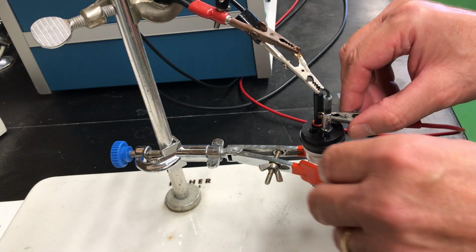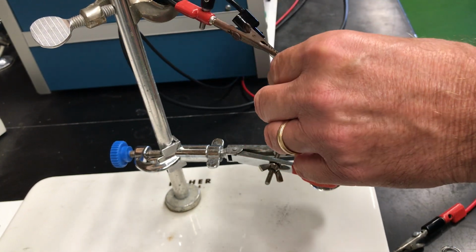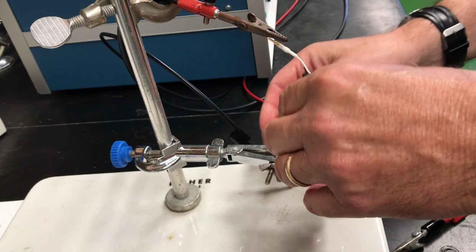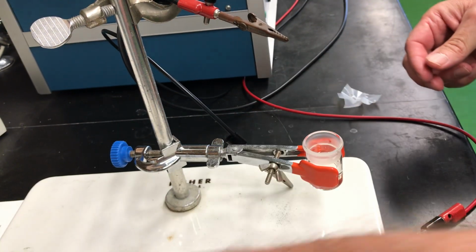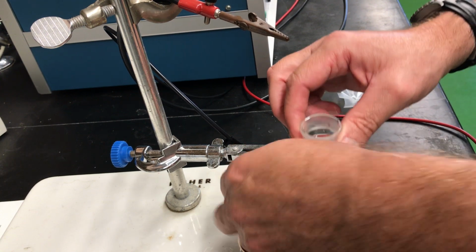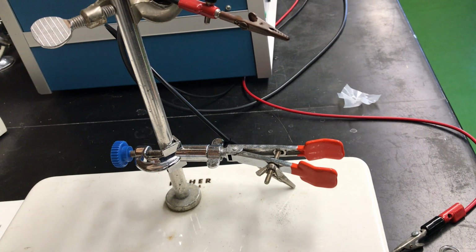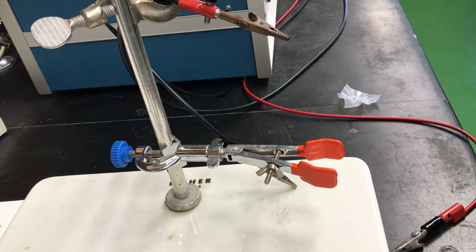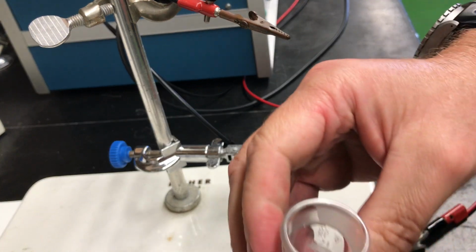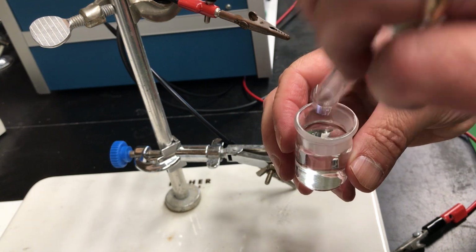All right, so I'm going to now unhook all of the connections from the electrochemical cell. I'm going to now pull out the electrode assembly and set it aside. And I'm going to pour out the buffer solution. So I'm going to pour that right back into the waste container here. And now I'm going to come back and take the contents of the volumetric flask, which contains the standard acetaminophen solution, and pour that into the cell container.